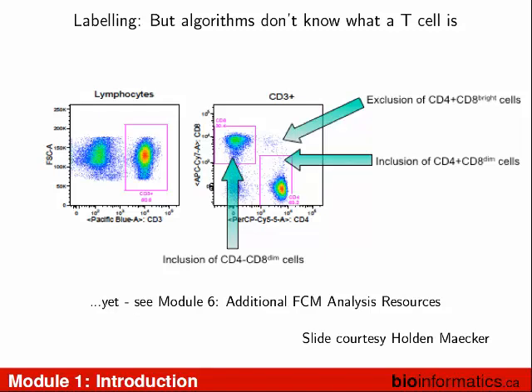They're all going to be CD3 positive, CD4 positive, CD16 positive, CD28 negative. And when you get these long strings on a sheet of paper, there's nothing that says this is an NK cell, this is a B cell. This is a pain point right now for automated analysis: translating what the computer spits out in terms of population labels into biology. And there's no link between what we do and what you do at that point. And this is where working with biologists who love you is really important, because it's really, really painful.